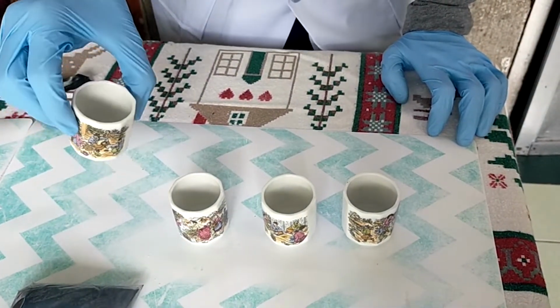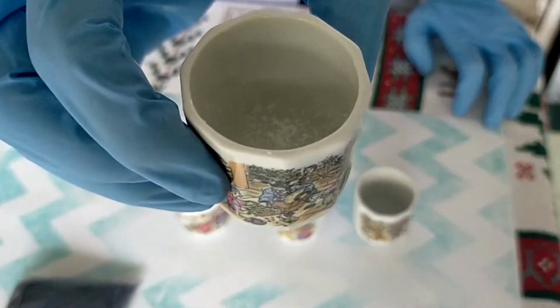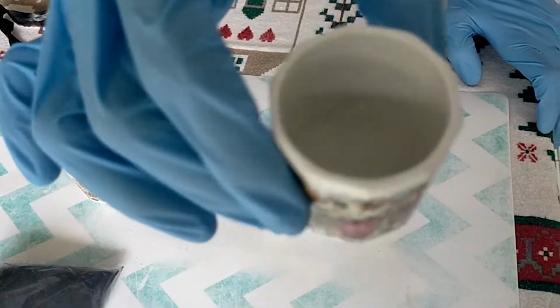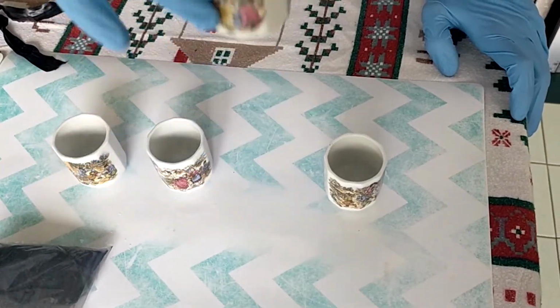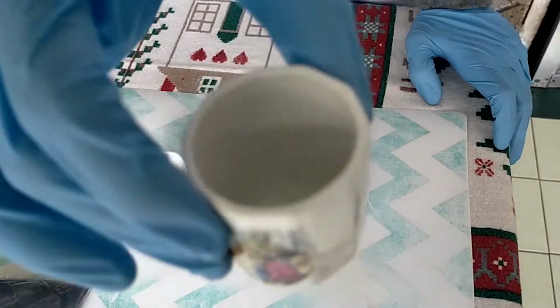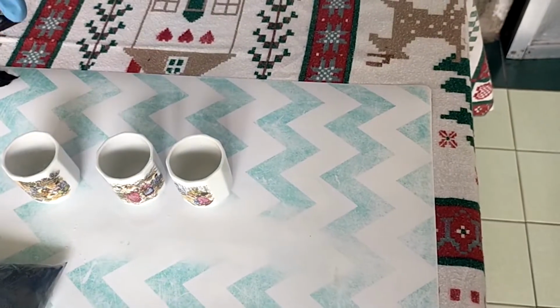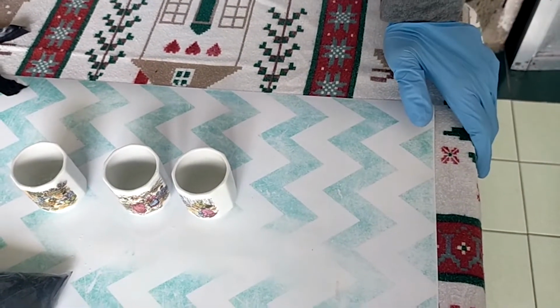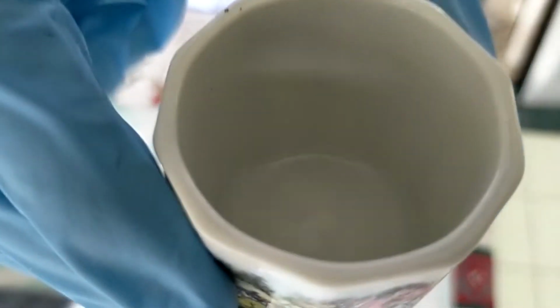For water, it still hasn't dissolved. For isopropyl alcohol, you see that it's rather dissolved here. Same with ethanol. For ethyl acetate, you can see some powder right here.